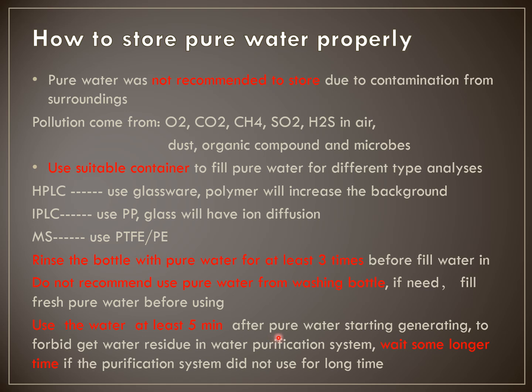If your water purification system has not been used for a long time, wait longer, 20 minutes or 50 minutes, to flush the system and remove the residues inside the system, then only start to collect the qualified water. This is all.